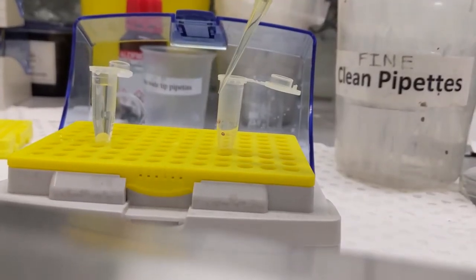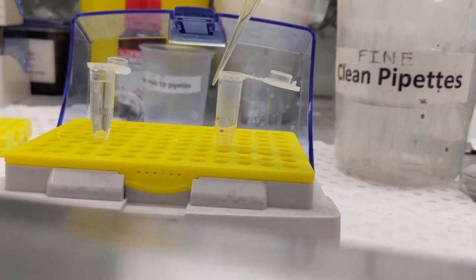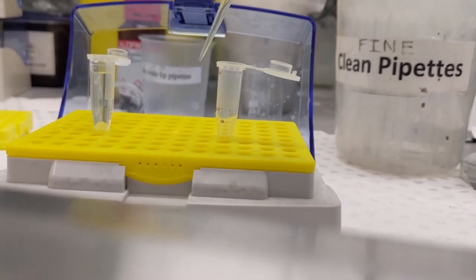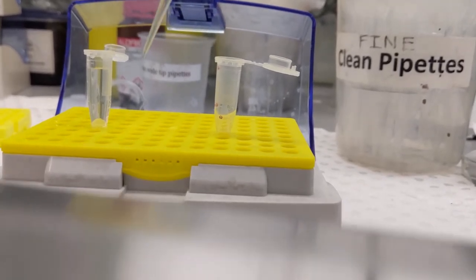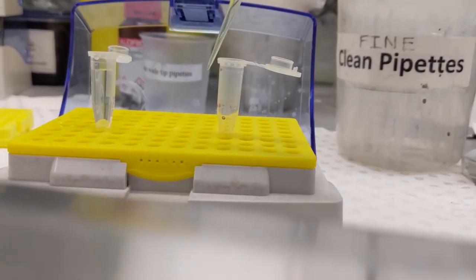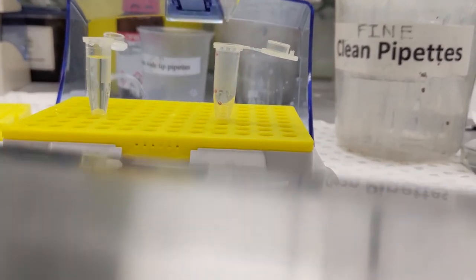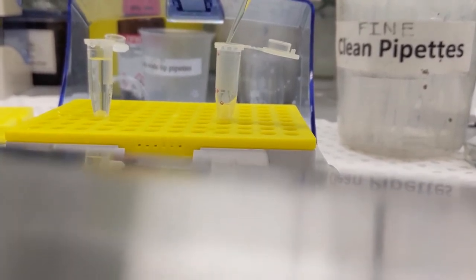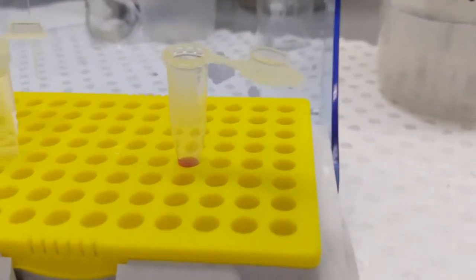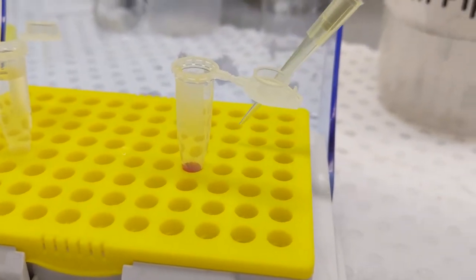Here I have 50 microliters of the nanoparticles in the citrate solution. We're going to dilute this down so that we get a nice thin layer of the nanoparticles on the TEM grid when we come to drop cast it. And what we're going to do is take 50 microliters of the Milli-Q water and add that to the nanoparticle solution. And you should be able to see just in the bottom there is the nanoparticle solution.